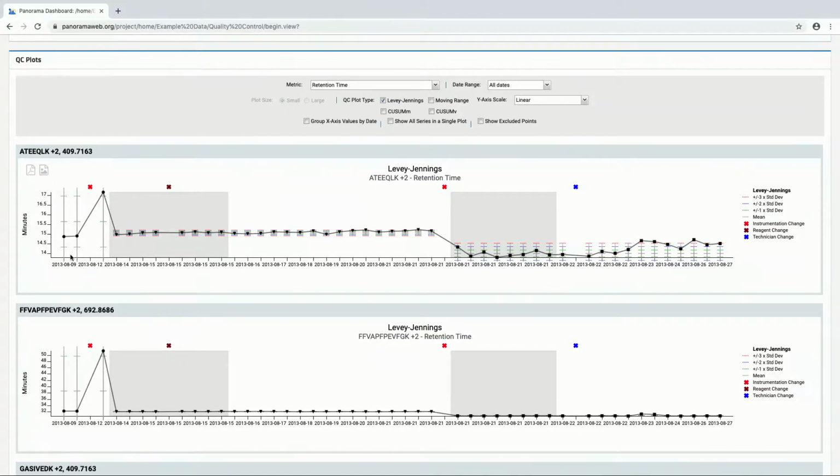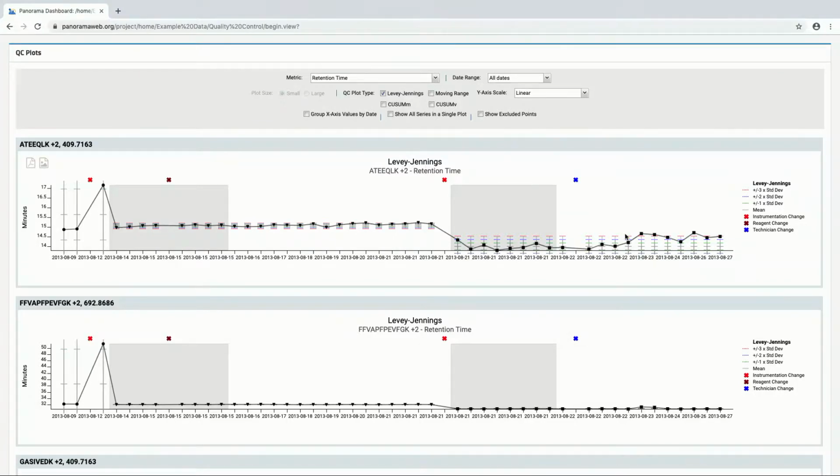And so we can see over time, this is data from 2013 through later in 2013 on the x-axis. And we can see the values, at least in this time period, pretty stable, pretty level. And our plots here are showing us, it's probably easier to see on the right-hand side, the mean is the line in the middle, the gray indicator. And then we've got plus and minus 1, 2, and 3 standard deviations from that with the red, blue, and green dashed lines.